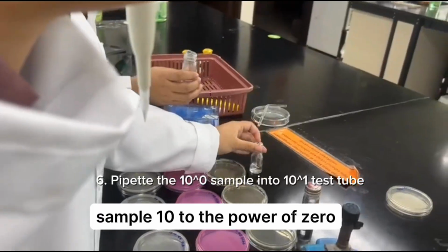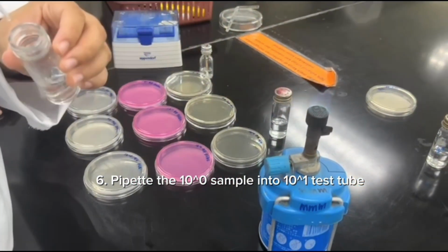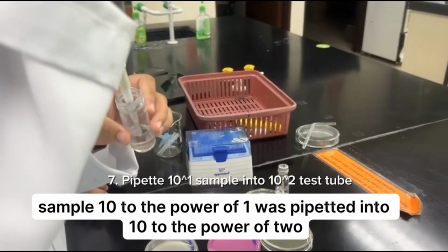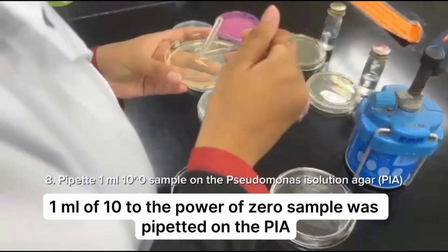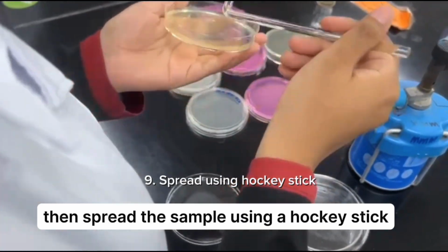Sample 10^0 was pipetted into a 10^1 test tube. Sample 10^1 was pipetted into 10^2 test tube. 1 ml of 10^0 sample was pipetted on the PIA. Then spread the sample using hockey stick.